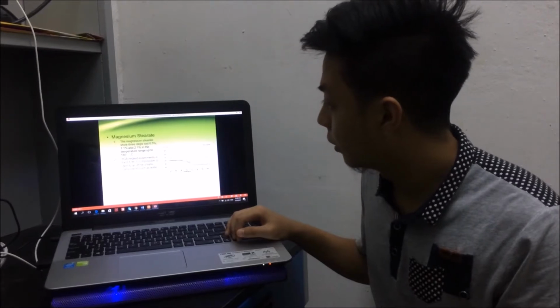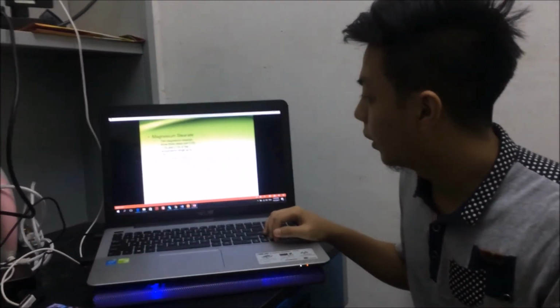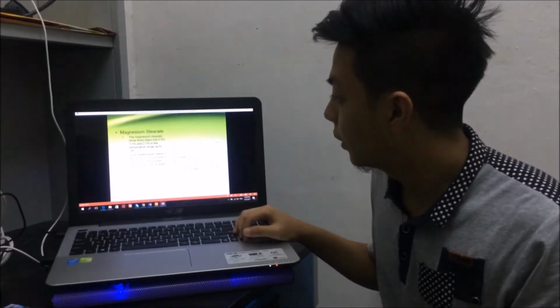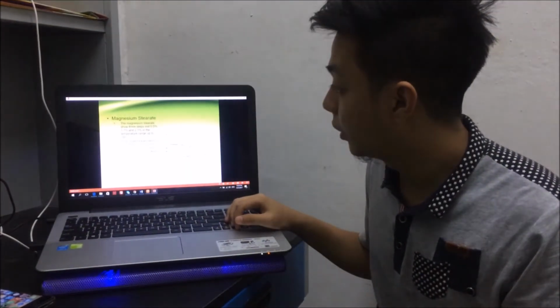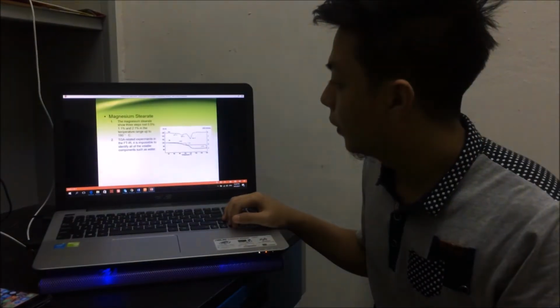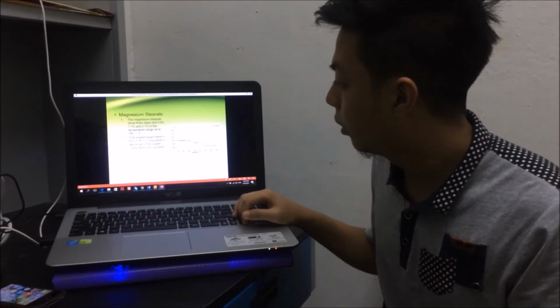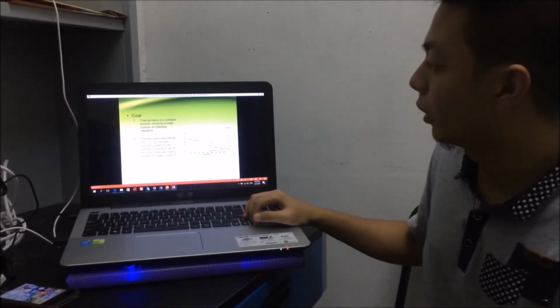Magnesium stearate. Magnesium stearate shows a 3-step loss of 0.5%, 1.1% and 2.1% in the temperature range up to 180 Celsius. In a TGA experiment related to FTIR, it is impossible to identify all the volatile components such as water.